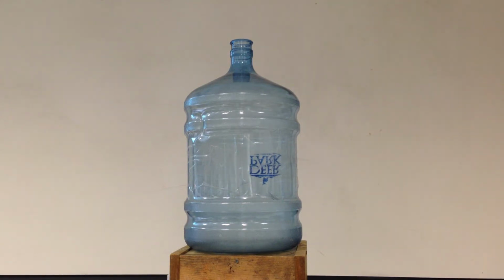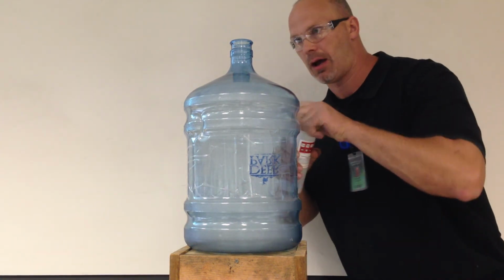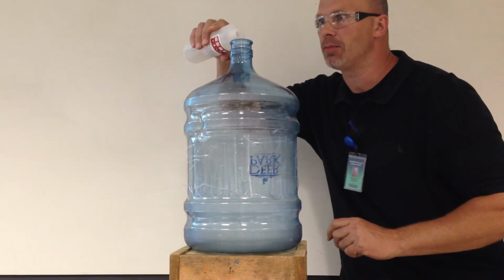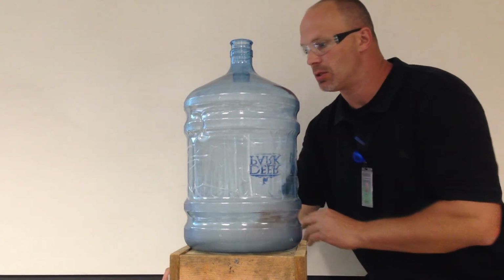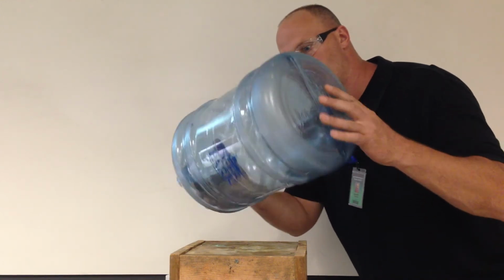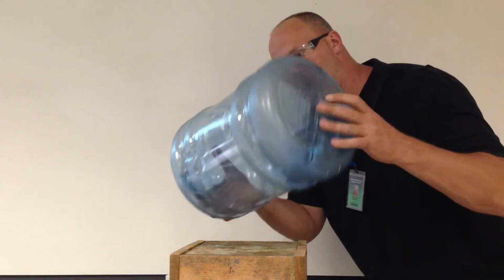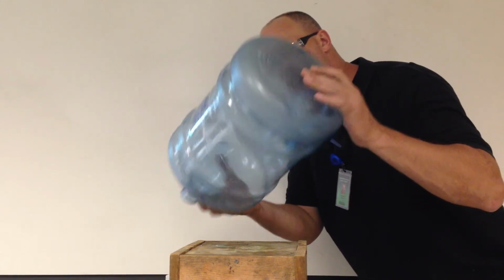So let me do that now. I'm going to take some methanol, okay, and empty it into my container. Certainly just put enough, I didn't measure. And what I'm going to do is evaporate it. I like to talk about evaporation as a cooling process at this point, and I have students feel the end of this, and it feels cold.